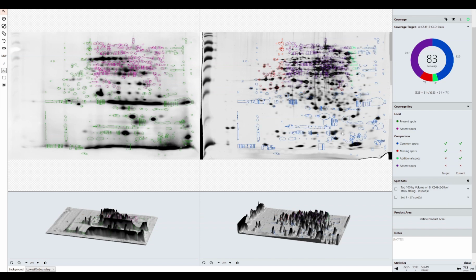So it allows you to break down all of this data to be able to work with it if you so wish. If you want to be able to break it down into looking at one area at once where you've got special interest, or you're expecting a product to co-purify or be detected by your antibody, it just really gives you options of being able to group your data and work within the larger spot map, especially if you've got a really large format gel and you've got like 1,000 spots. You want to break that down into really getting into the sensitivity of your antibody.